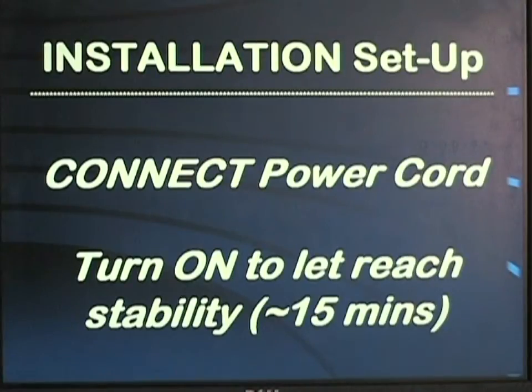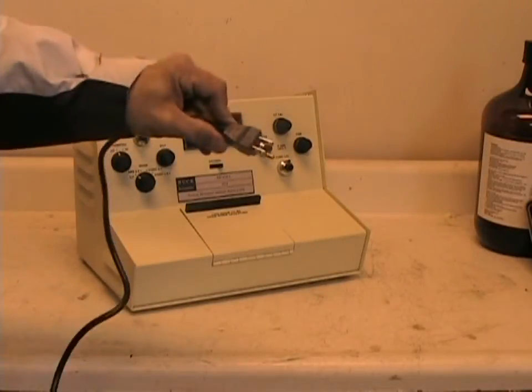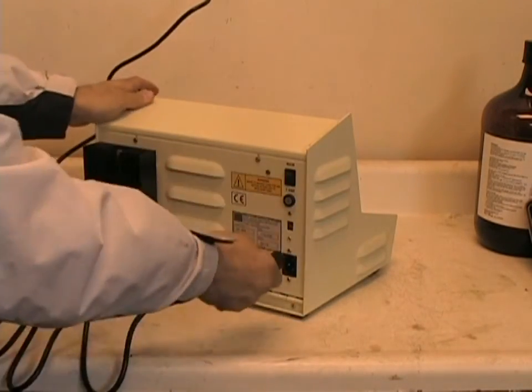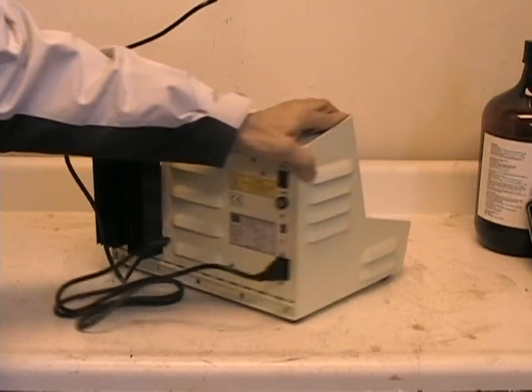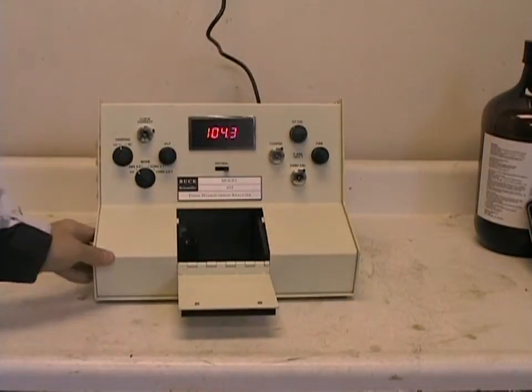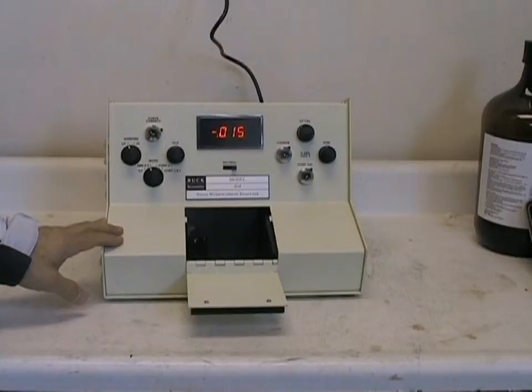To prepare the instrument for making a TPH or oil and grease measurement, connect the power cord from the back of the instrument to your electrical wall socket. Turn the instrument on and let it warm up for at least 15 minutes to reach stability. The power switch turns the system on; open the door to perform any analysis and set the mode switch to absorbance mode to gauge the stability of the instrument.